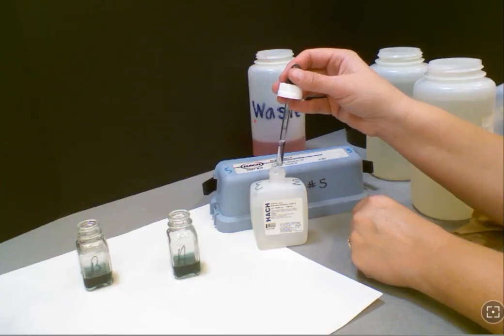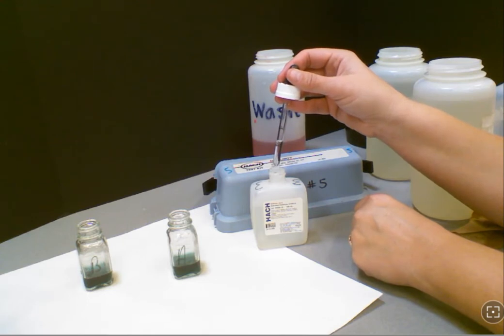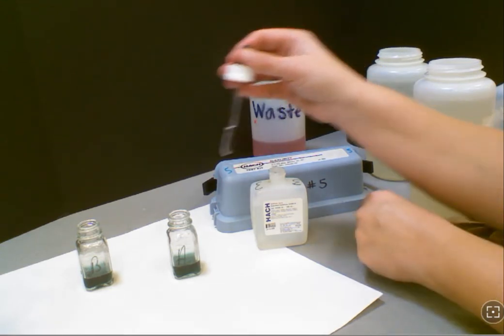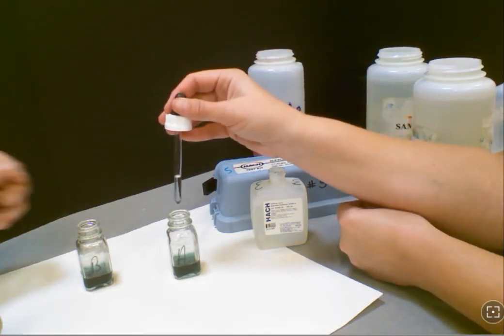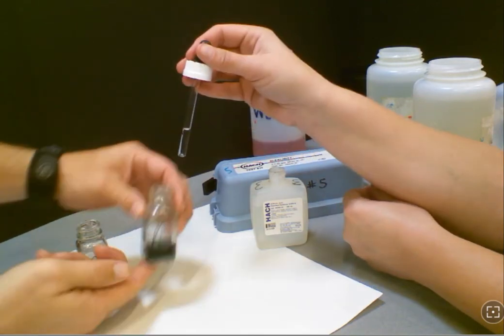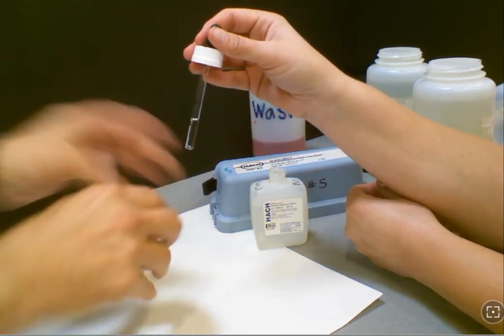So now we're ready to titrate both our sample A and B, and this is helpful to have your group at this point. One student can swirl, another student can drop, and then the other students can help count. It's very important that you keep track of the drops.